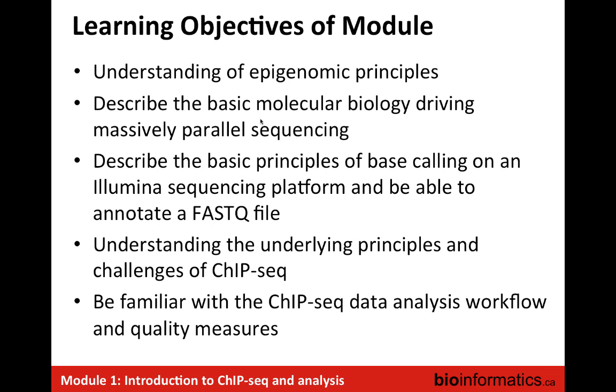Prior to NGS, epigenetics was limited to some very focused array-based studies. From my perspective, understanding the molecular biology as well as the computational side is essential to do your research. The output of the molecular biology, of course, is the FASTQ file. How many of you know what a FASTQ file is? Okay, good. Some of you do, most of you do. So we'll go through that real quick.